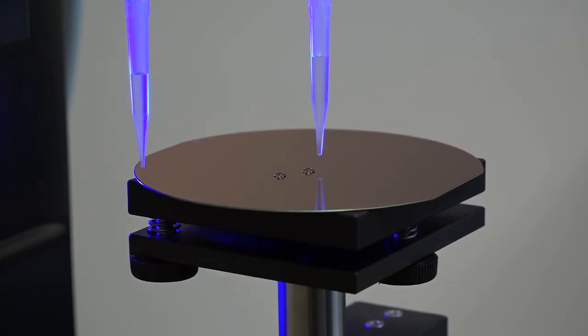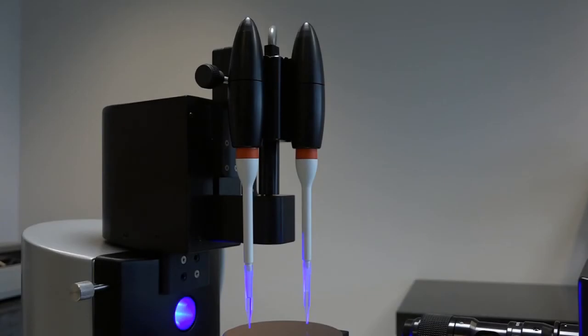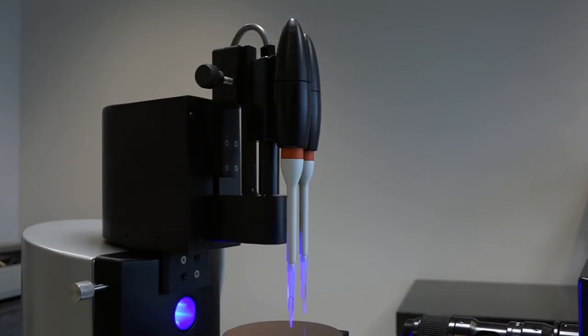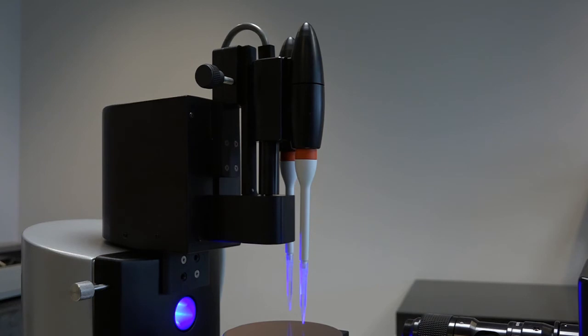The functionality of the system is based on using two disposable tip dispensers that have an automated rotation, which will always bring the active dispenser into the image.